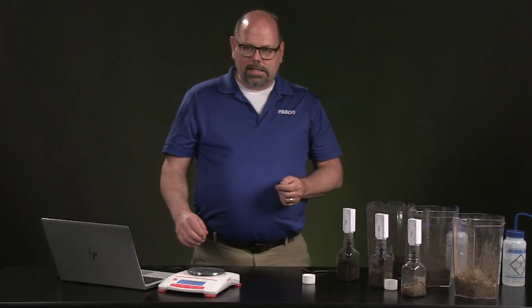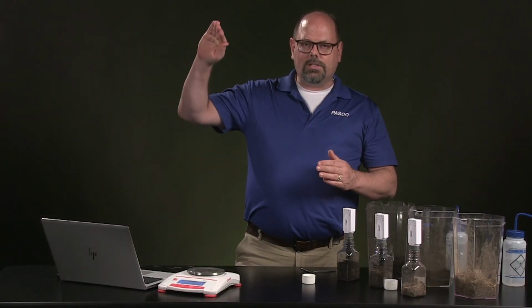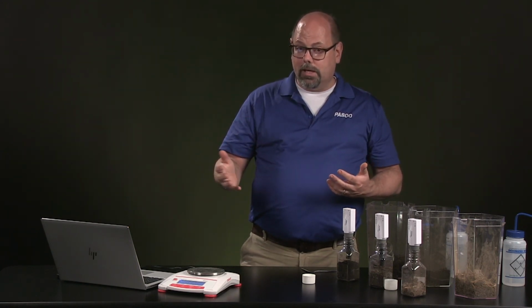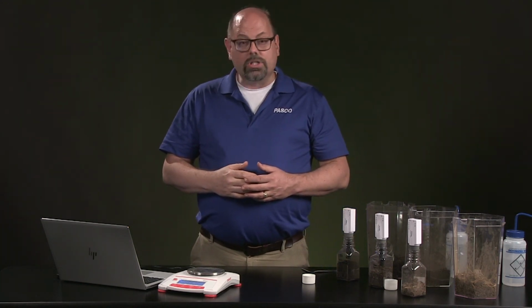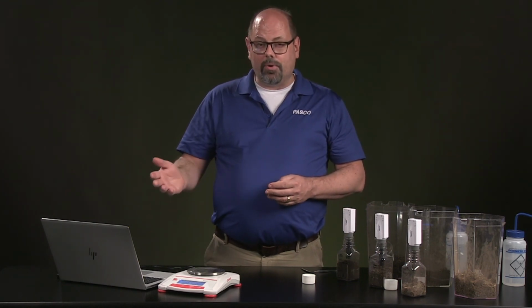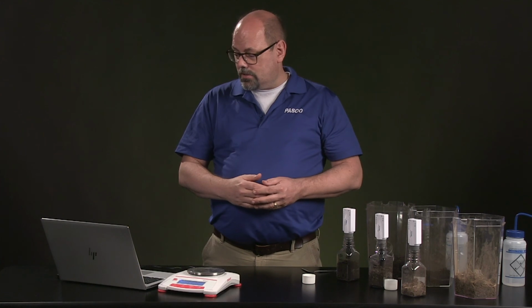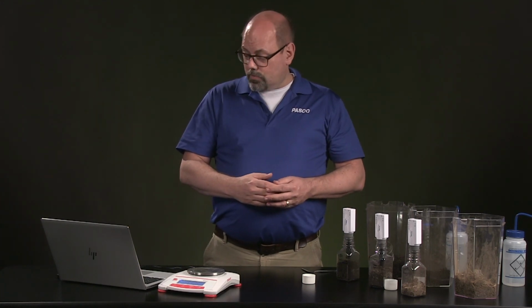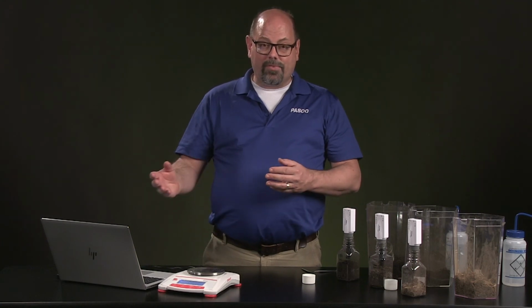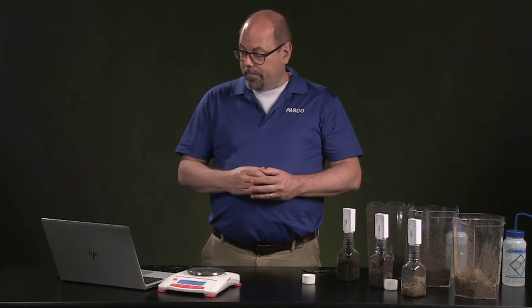Because these are very consistent, if I saw that there were, for instance, a bend in the line, I might run this for up to 3 minutes as just a suggestion, to see if we get to a steady part of the process of delivering CO2 to the sensors. But these all seem very straightforward. So I'm just going to go to 2 minutes instead of 3 to save us a little time as you're watching. And then we're going to stop those, and I'll talk about what we want to get from those graphs in a little bit.